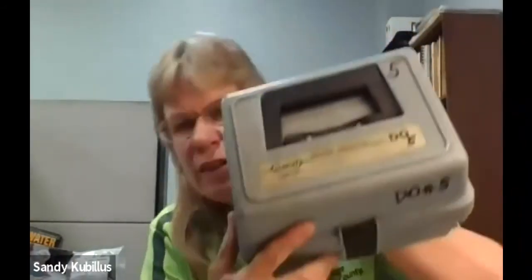In the lab, how we typically measure dissolved oxygen is with a test kit called a Hach test kit for dissolved oxygen, where you'd use various chemicals and water bottles. And it takes about 15 minutes. It's fairly long to do that.